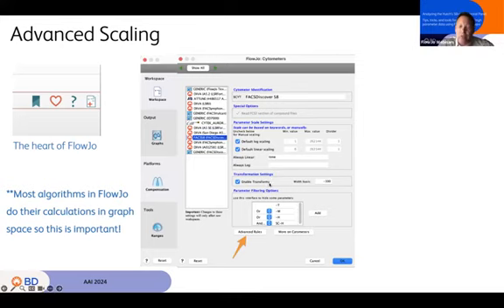Number one, on that particular machine, and for a lot of machines actually, I do recommend that you hide some of the parameters that appear in all your drop-down lists within FlowJo. For the FACSDiscover, we get a dash A, dash T, dash W, and dash H version of every parameter. And you can see on my screen that I've said, you know what? I'm largely going to work with the dash A version of the parameters. You can just hide all the dash T, W, and Hs so that my drop-down menus are more concise. There's only one version of CD3, CD4, et cetera, in my list because I've hidden the Ts, Ws, and Hs.